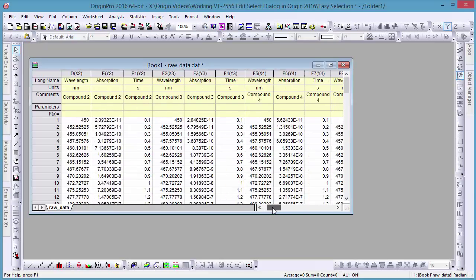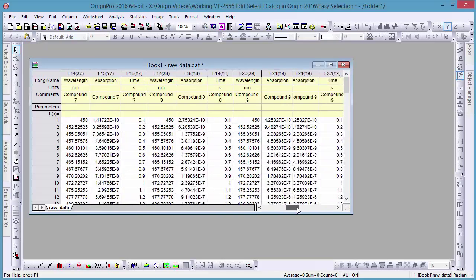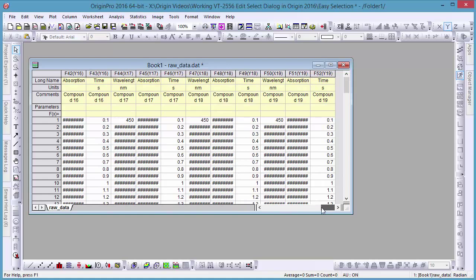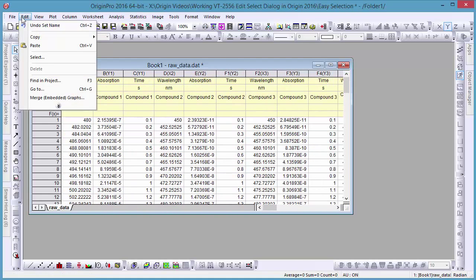In some instances, we may have sets of columns from multiple trials which contain the same type of data. For example, let's select specifically those columns which contain absorption data.